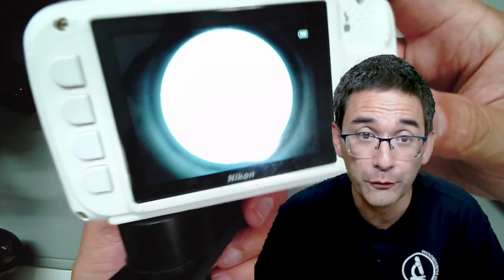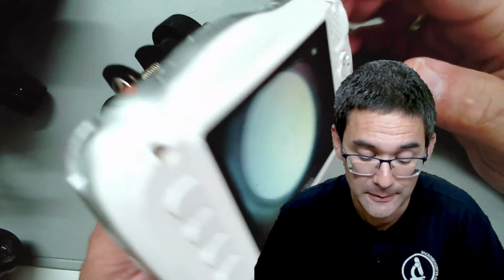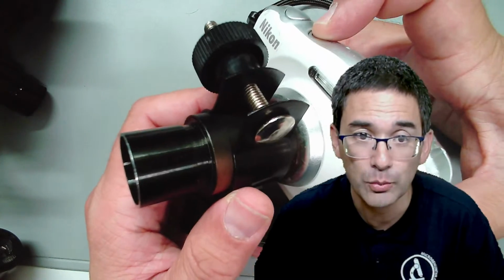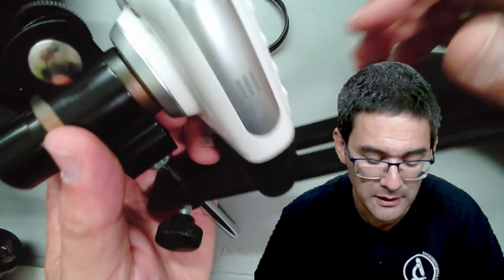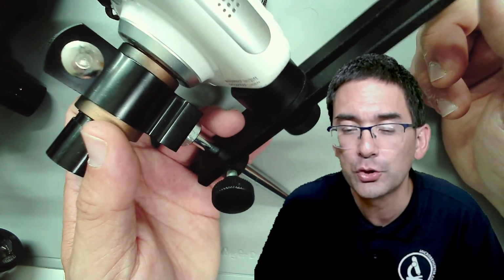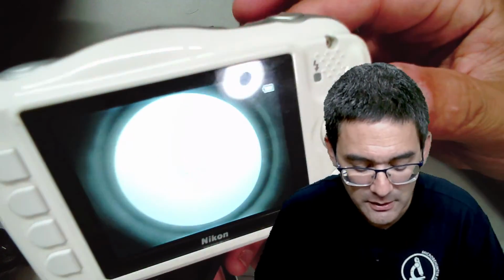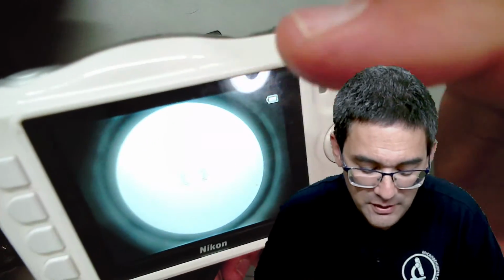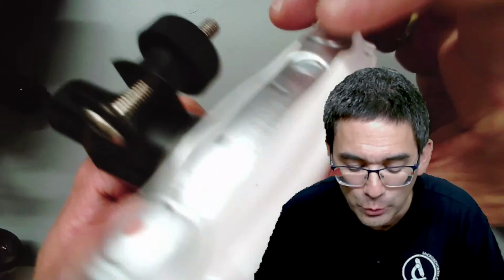Again, afocal photography, and I've seen people who've not used a clamp like this, but who actually set up a tripod in front of the microscope. So you can also do that. I've been using something like this as well, and it works reasonably well. So that's also a possibility, especially because it's not so expensive, because this adapter did not cost so much, and many people already have compact cameras at home. So it's indeed a solution. But again, very sensitive to set up, and as soon as it's a little bit off, then it starts to become fuzzy and not evenly illuminated anymore.